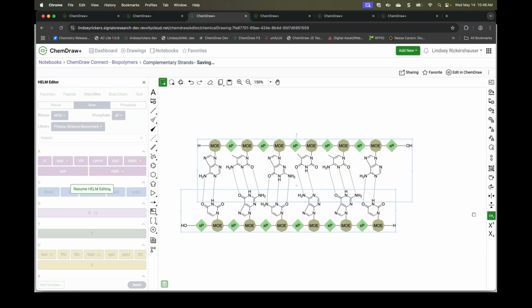We're still mapping those hydrogen bonds. And it is mapping it based off of the natural analog that those residues, those custom modifications, map to. So in the case of the 5-methylcytidine, of course, it maps back to cytidine, so you should see the appropriate hydrogen bonds as long as the hydrogen bond acceptors and donors are still present to provide those hydrogen bonds mapped between those sequences.